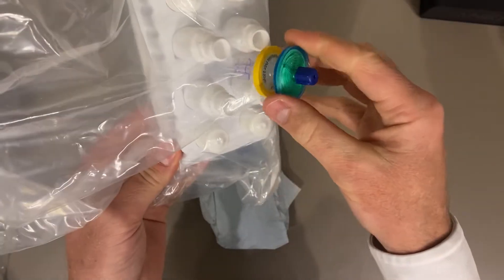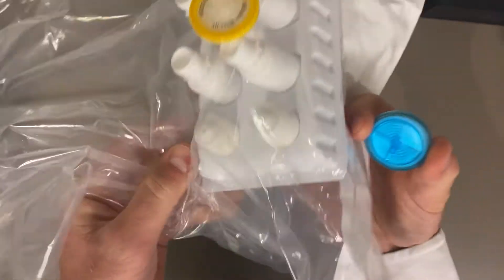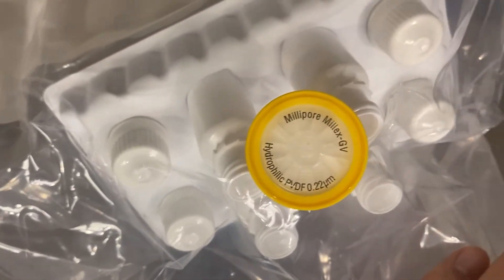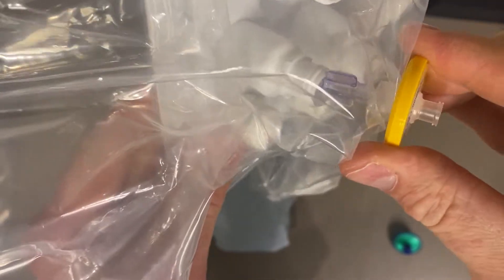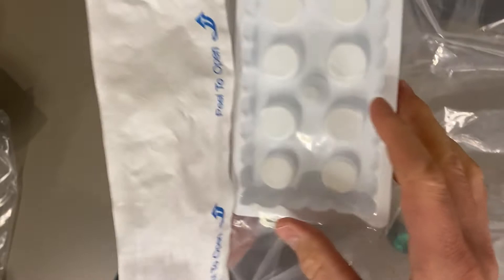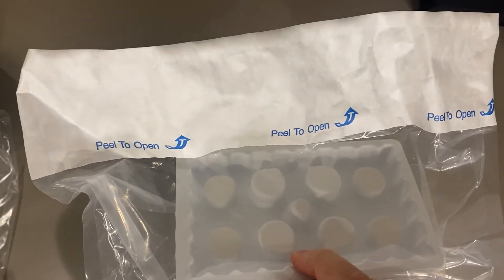Here's the sterile bag. There is a 0.9 micron filter for larger particles, and then a 0.2 micron sterilizing grade filter that's coupled to the bag in a way that permits interaction with the outside while preserving sterility inside. There's a nozzle on the interior of the filter with wings that facilitate filling of the eyedrop bottles. And when all the bottles have been filled and sealed, the bag can be peeled and opened, exposing the contents to the non-sterile environment for the first time.